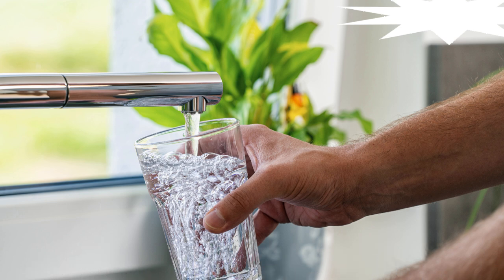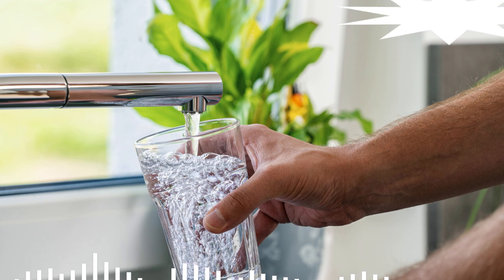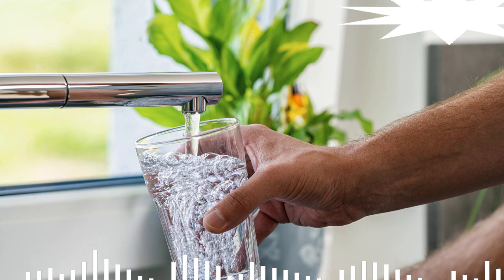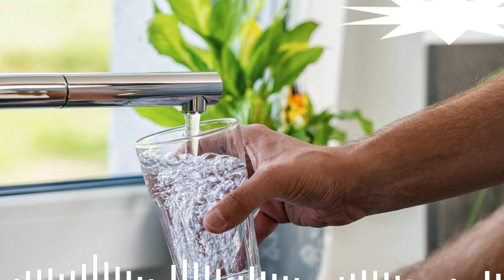Step 3. The resulting mixture is then titrated with Trilon-B using a microburette. Trilon-B is added carefully, drop by drop, until a blue color is obtained. Further, it is noted how many ml of Trilon-B went to titration with an accuracy of hundredths. 2 samples are titrated for the purity of the experiment.